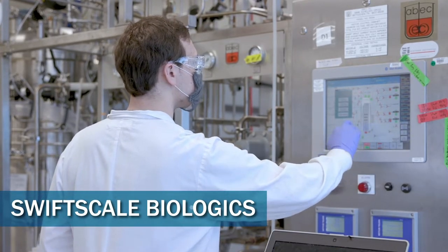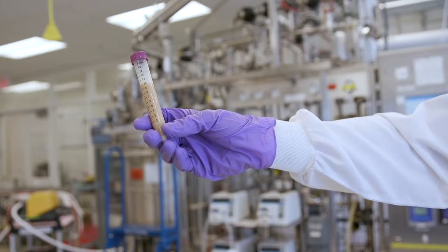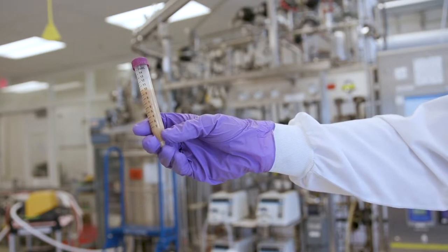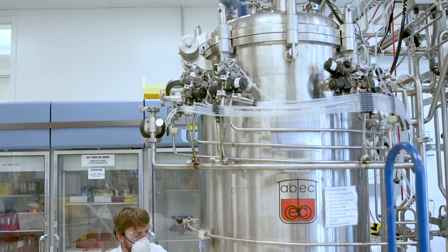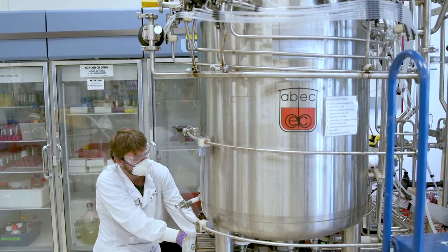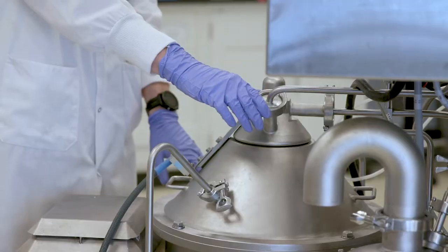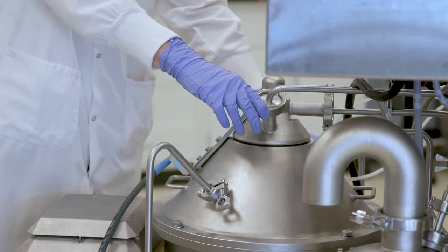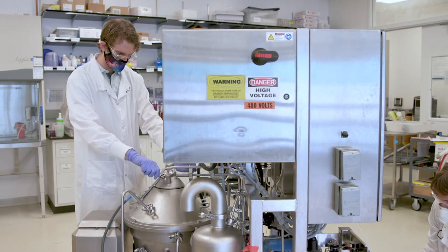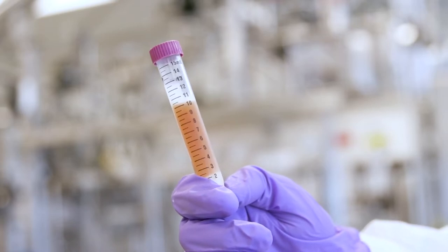SwiftScale is developing an antiviral protein to counteract the COVID-19 disease. We're helping them scale up their process from 250 milliliters to our 300 liter reactor here. The goal is to make the protein available to as many people as possible as quickly as possible to fight the COVID-19 disease.